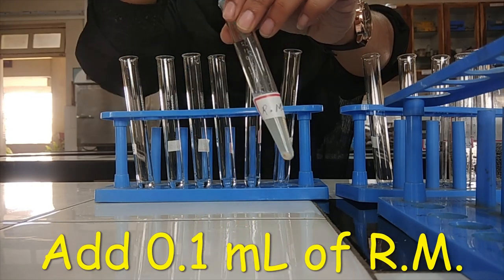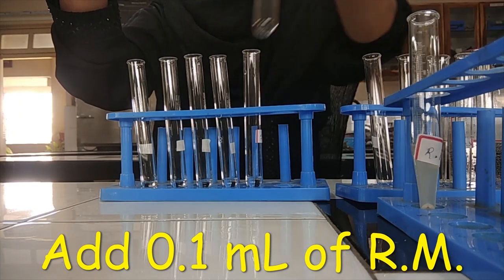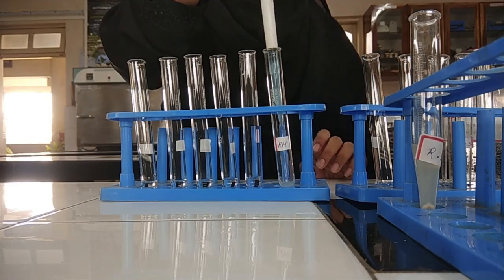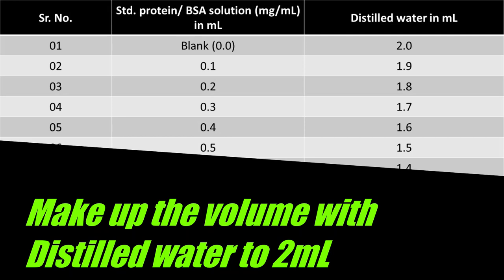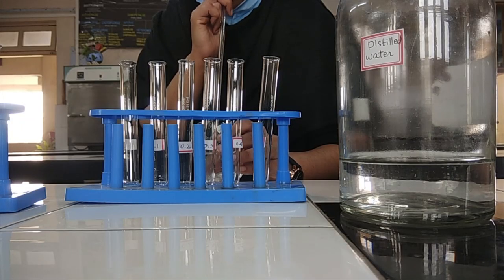In the test tube of RM, measure 0.1 ml of reaction mixture. Make the volume of each test tube up to 2 ml with distilled water. Refer this table to understand how much amount of distilled water to be added in each test tube.